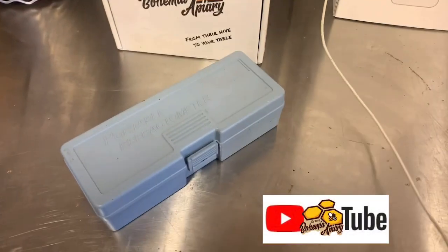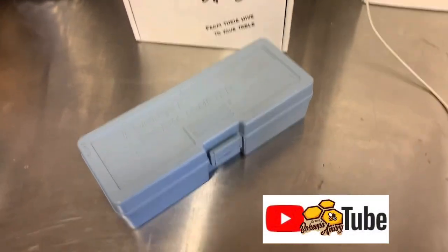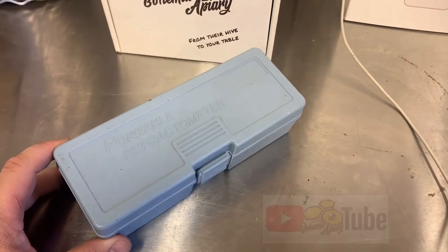Good afternoon bee people! This is Jason here from Bohemia Apiary and we are going to show you a little device that us beekeepers use.